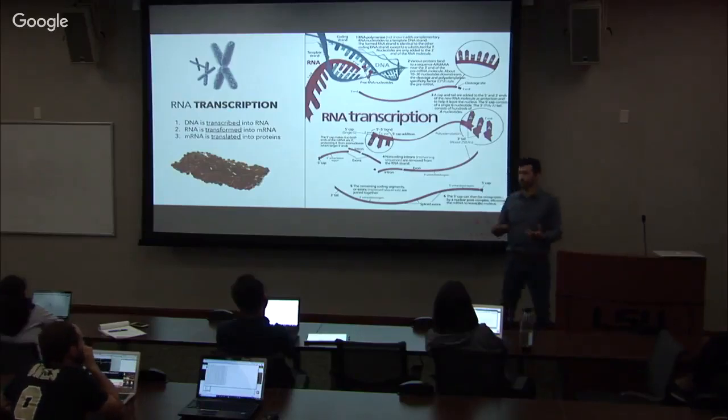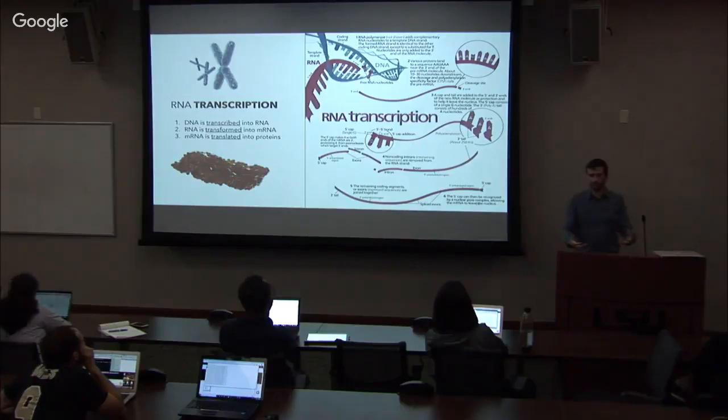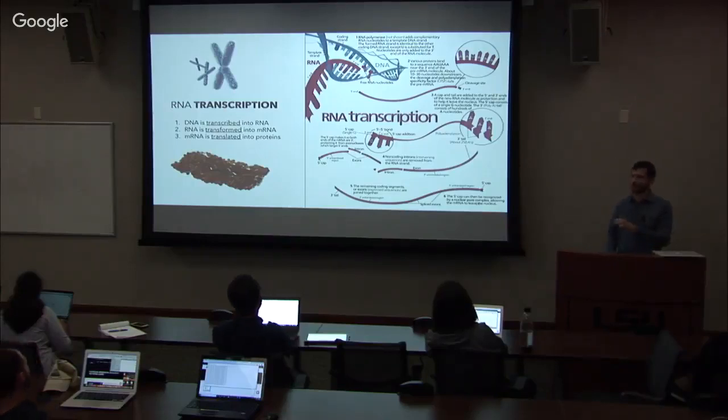How are the different exons spliced together, and how do they form what we end up seeing as transcripts? So let's take a look at this process in detail and try to understand what exactly we are expecting to get in these raw FASTQ files.